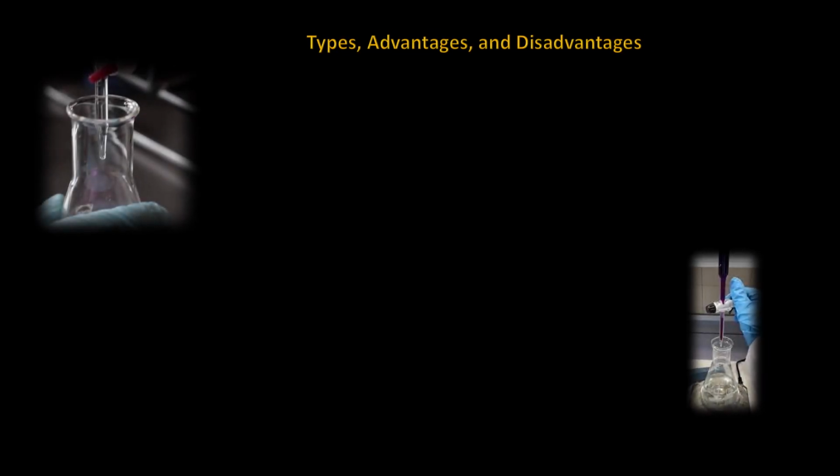As previously mentioned, there are different methods or types of titrations that can be performed. For the small-scale miner, prospector, and/or hobbyist, there are 4 types that would probably be used: acid base, precipitation, redox, which is commonly referred to as oxidation reduction, and complexometric.